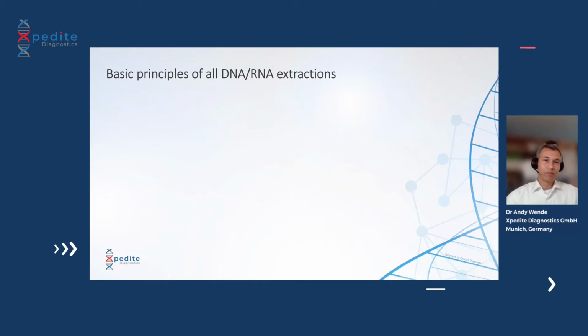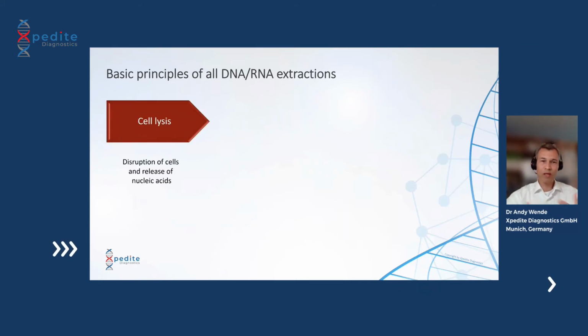Right. So nucleic acid extraction is a very wide field, and I want to first provide you the core basic principles of how it always works. No matter how it looks, it always follows these principles. First of all, you have to disrupt your cell. The cell shell needs to be lysed to release nucleic acids.